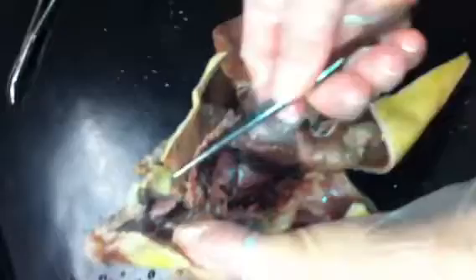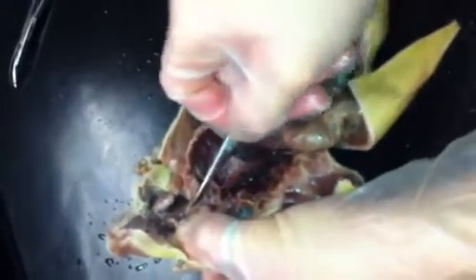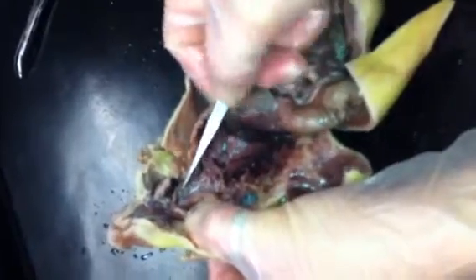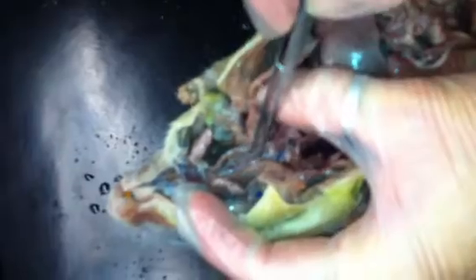Okay. And what I'd like to see is the trachea too. So there's muscle tissue. So underneath this is the trachea. So I'm going to just set that aside. Pull that aside. And can you see that there's an obvious tube right there? Alright. So that's the trachea. And I'll let you guys excavate around, but just behind the trachea, it should be the esophagus, which is a flat tube. So again, rather than doing any cutting, just try to maybe move and separate. And then I think this is the esophagus here.